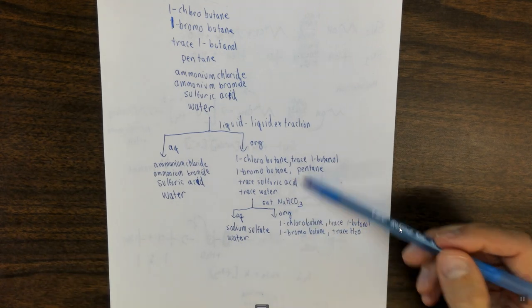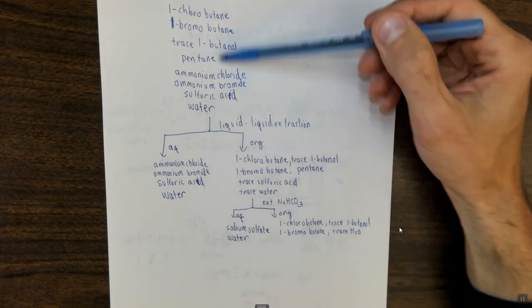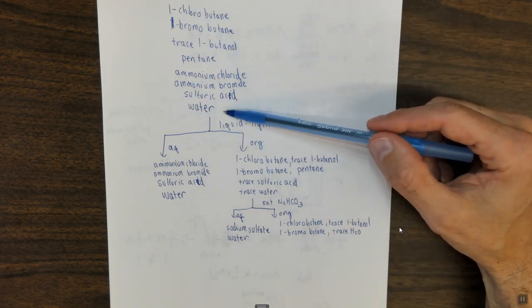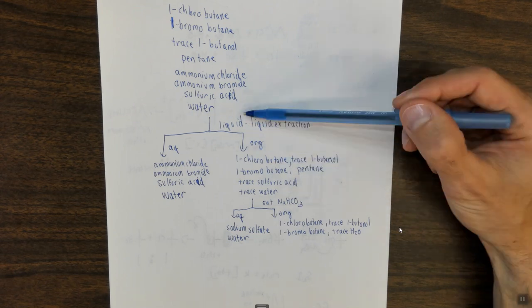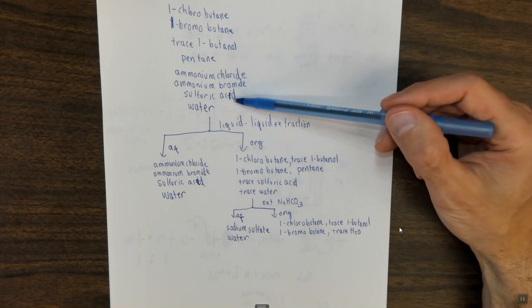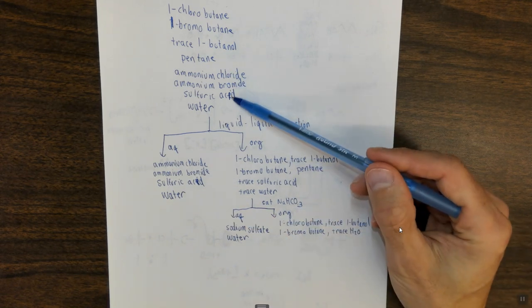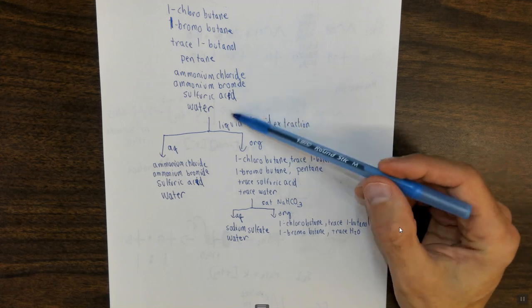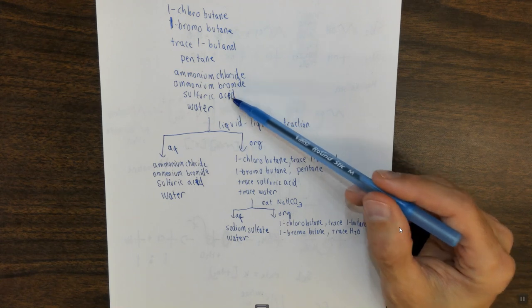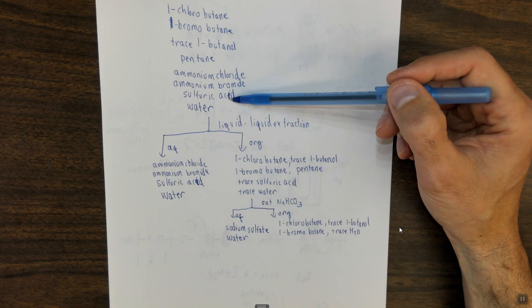So notice that the purpose of this step was getting rid of the traces of sulfuric acid. It's important to remember from a safety standpoint, this is super, super important. If you add saturated sodium bicarbonate to this mixture, you're going to have problems, because a separatory funnel is a closed system. When you add sodium bicarbonate to sulfuric acid, you get carbon dioxide. So you need to get rid of most of that sulfuric acid in the first extraction step. If you add this to this, the separatory funnel lid can pop off and the entire separatory funnel can actually explode. I've seen that happen before.